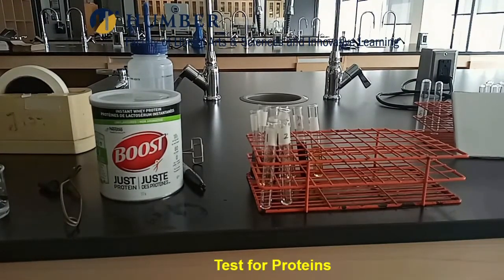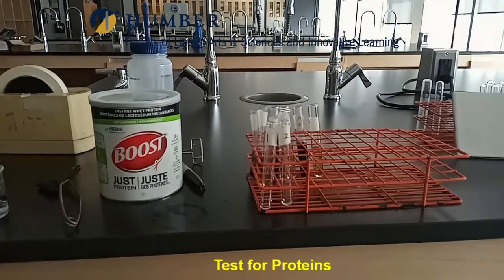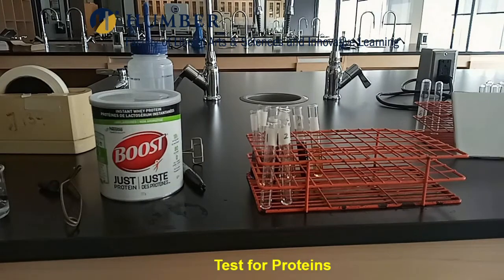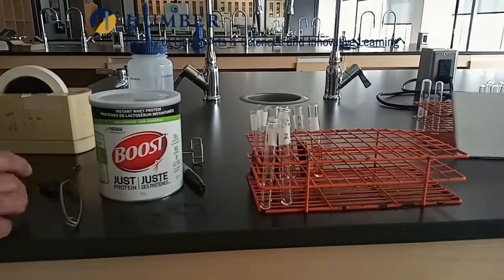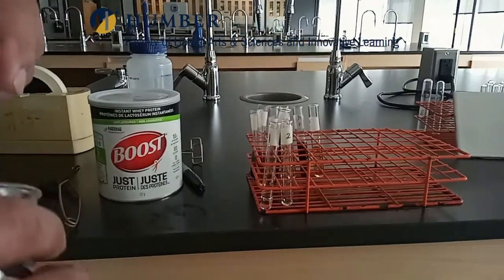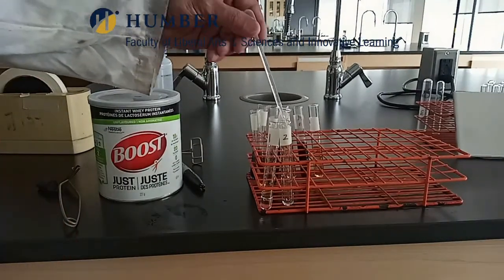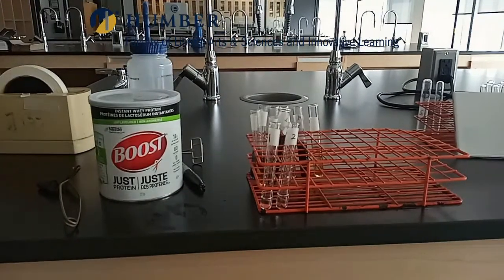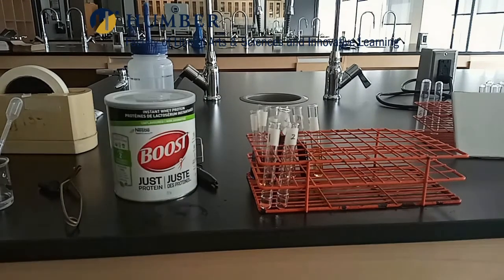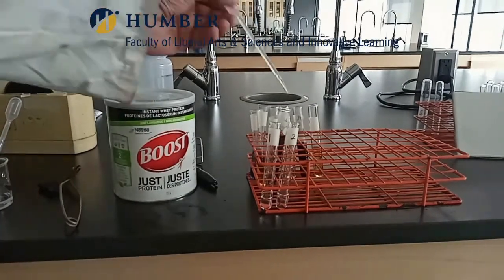Label test tubes 1 and 2. This is the test for protein. We will add 2 mL of distilled water to both the test tubes. We will add 4 drops of protein, just 4 drops, to test tube 2.